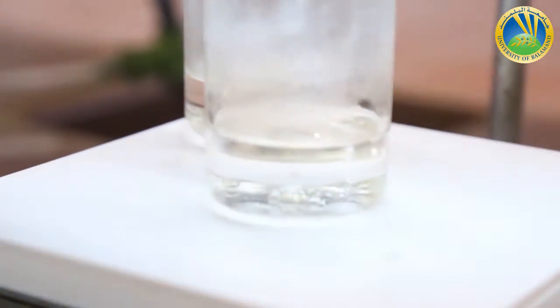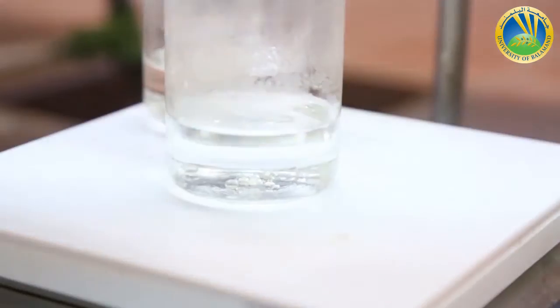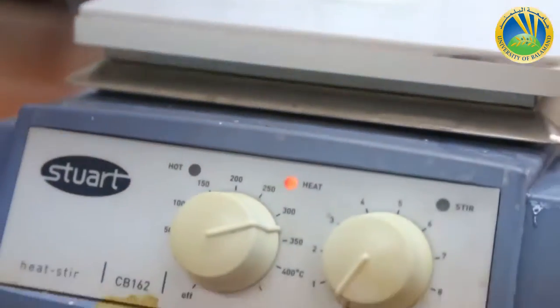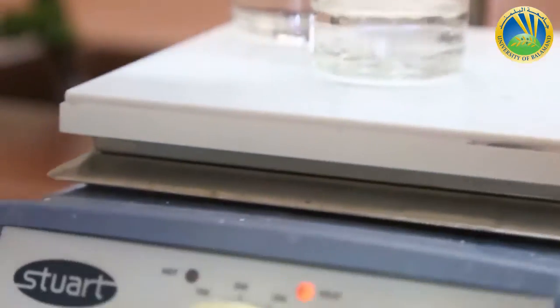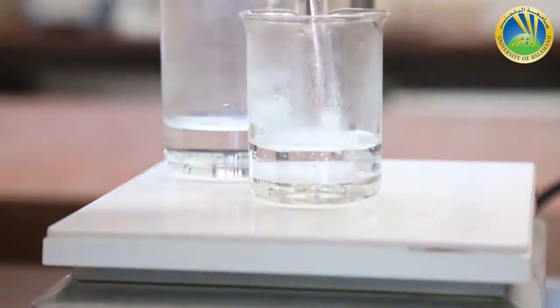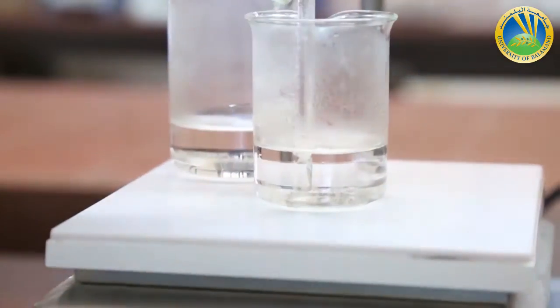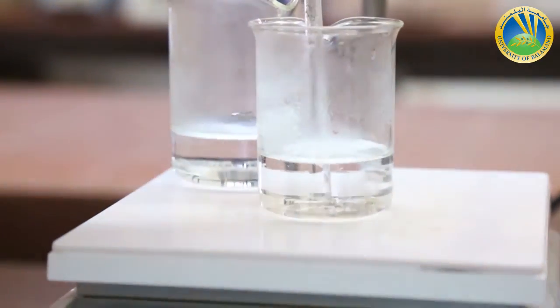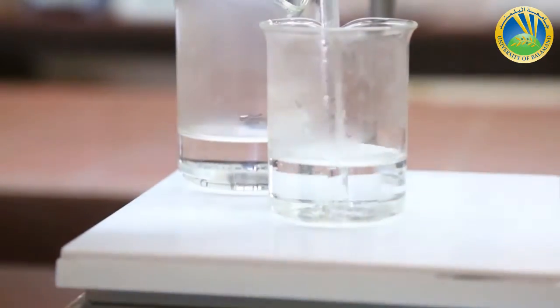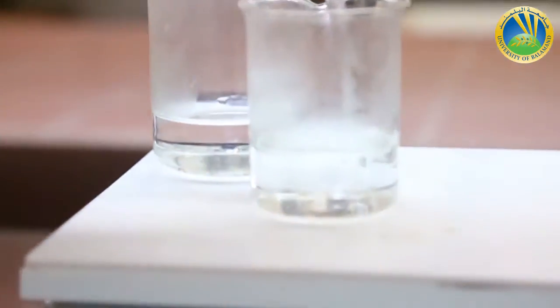That's why there is an utmost need to do a hot filtration to discard all those insoluble impurities, and this step should be very quick. Now waiting for the water to boil to make sure that I have dissolved all the amount of acetanilide. Those impurities are not soluble. I still have some granules of acetanilide. Now the water has started to boil.